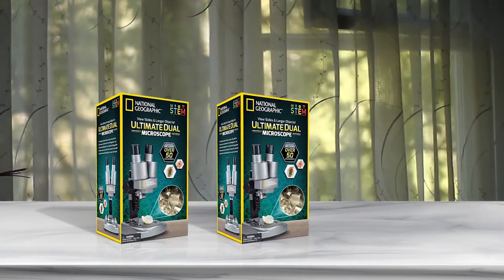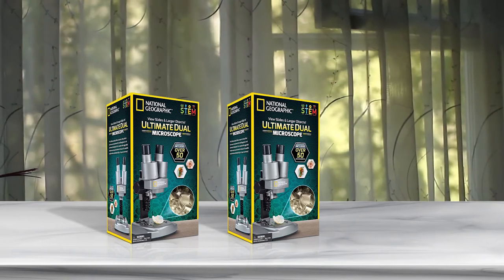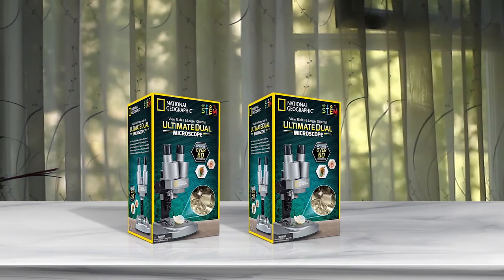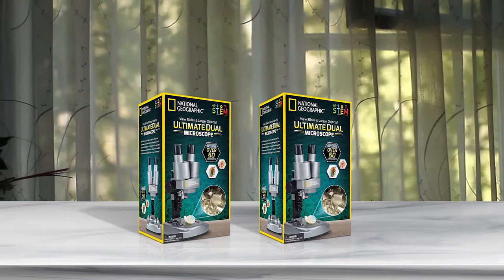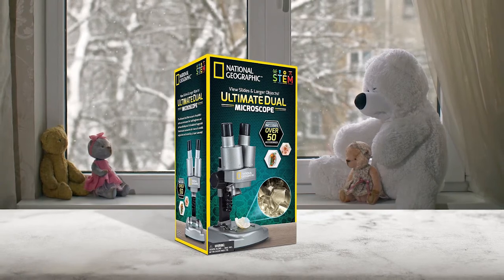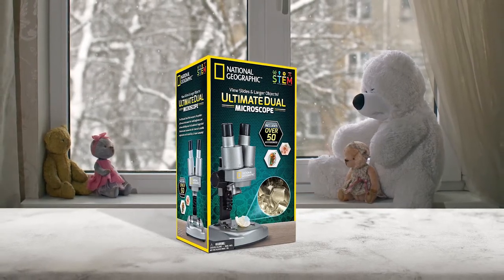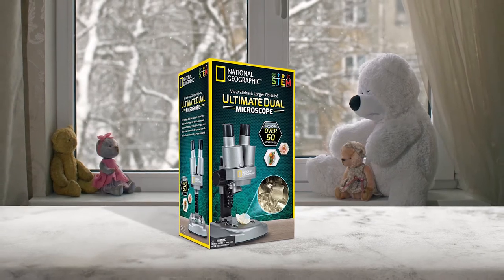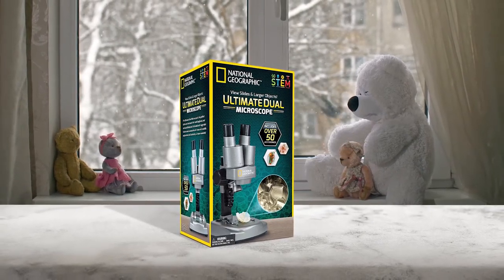The carrying case contains 50+ accessories — for example, a set of prepared slides, coverslips, tweezers, dyes, petri dish, etc. This microscope is not used for seeing cells; the highest magnification goes up to 50 times. It also includes its own brine shrimp experiment.